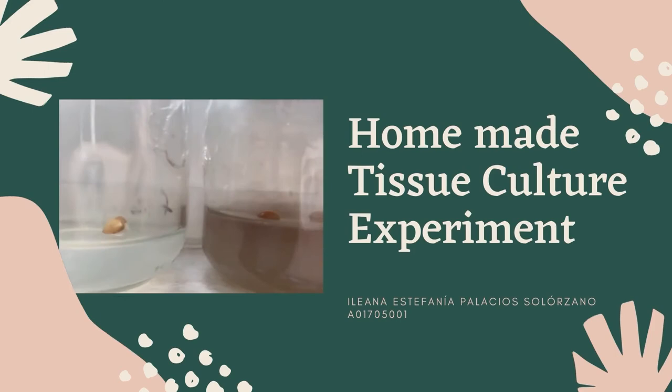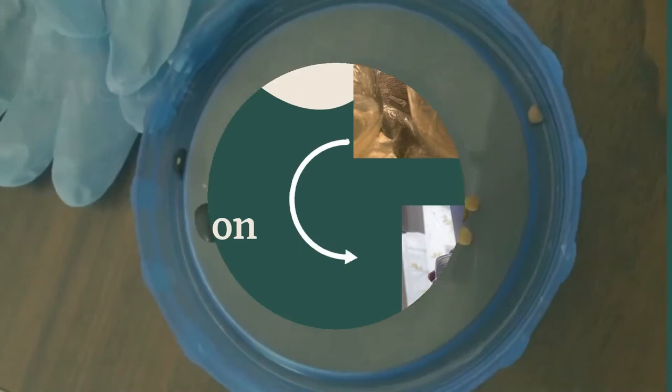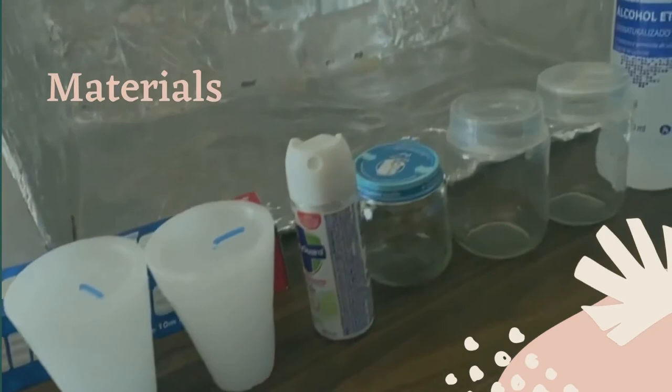The purpose of this experiment was to carry out a homemade tissue culture experiment with the aim of obtaining the germination of a seed. The experiment was done with bean and lentil seeds. The materials I used were a laminar flow hood made with aluminium and a cardboard box.